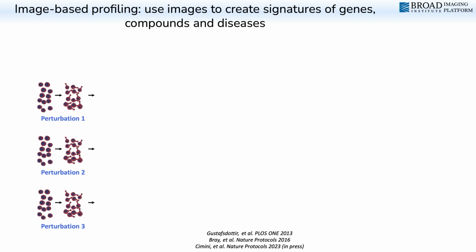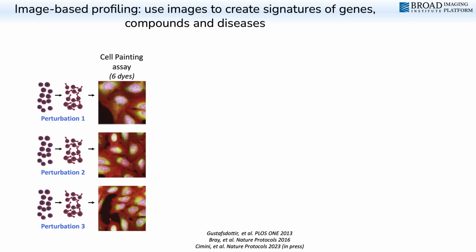And then you go and stain them with some fluorescent dyes, these dyes that mark different structures in the cell, and when you shoot lasers at them, they glow. So now you do that, right? So now they're frozen in time, you have these fluorescent dyes, and then you go and image these. You go and image these cells under a high throughput microscope. These microscopes are amazing. They can just capture millions of cells in a couple of hours, right?